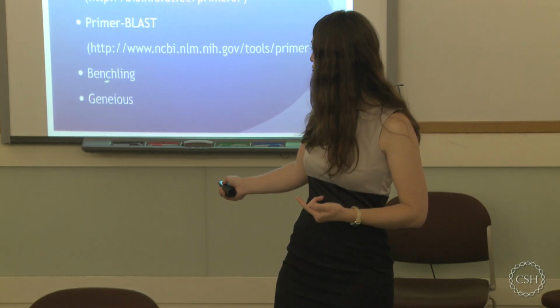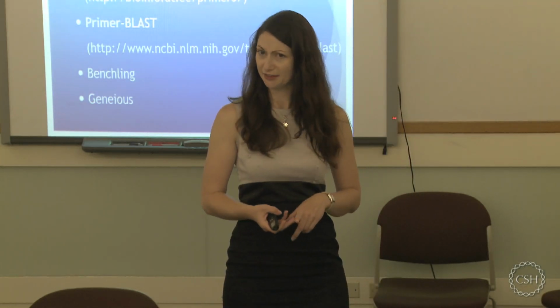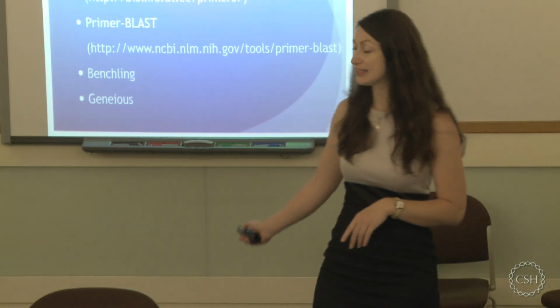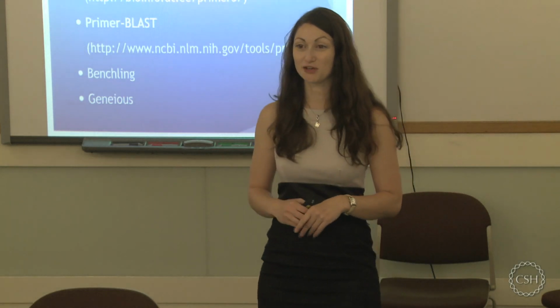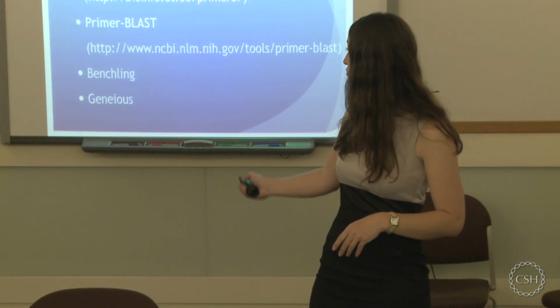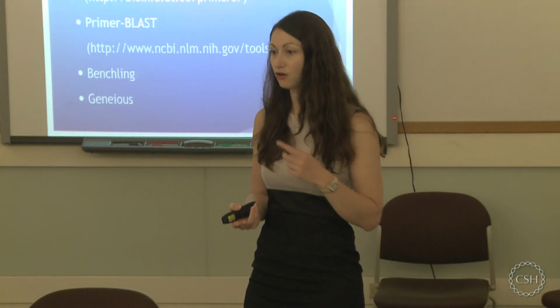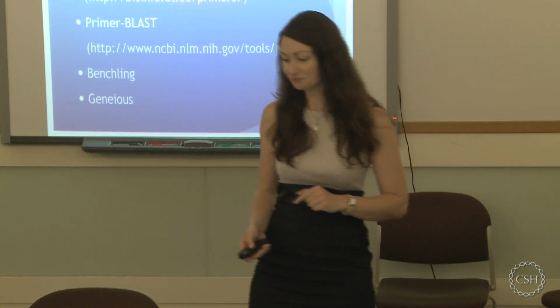There is an open source software called Benchling, which can be used also for cloning, and I think maybe nowadays even for high throughput sequencing analysis, a little bit at least. So you could have a look at that, it's for free. And then there's something which I have used a lot in the past because it's one of the few softwares which run on a Mac, and that's called Geneious. However, that's not free. It is also based on Primer3 though, and it also has all these Vector NTI opportunities, like you can do cloning or also high throughput analysis. Actually with this one I know for sure you can do that.